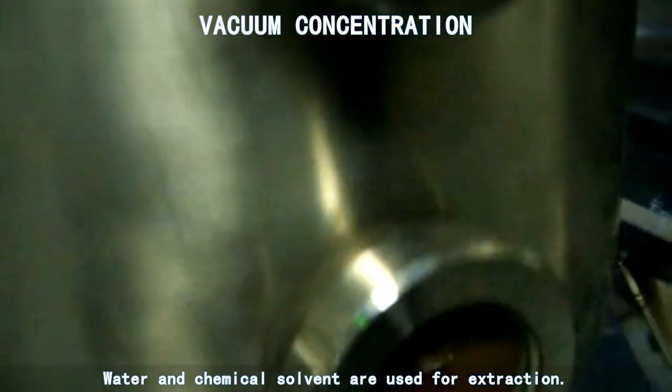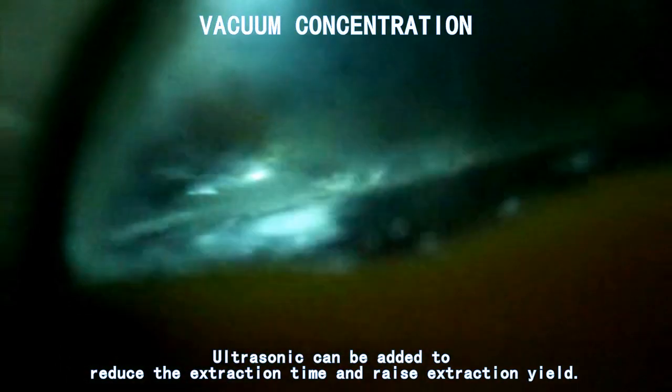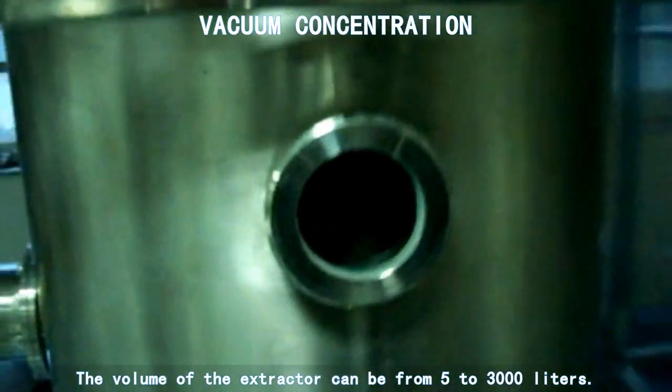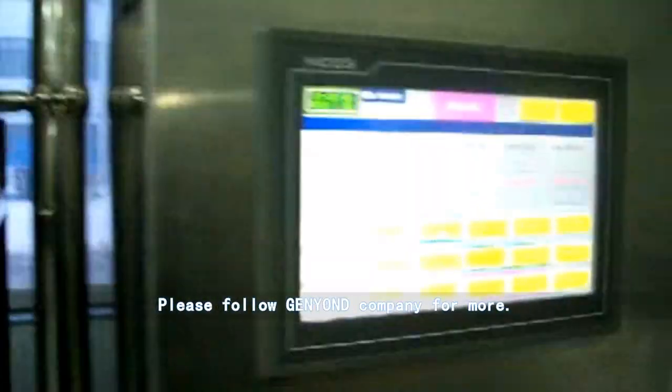Water and chemical solvent are used for extraction. Ultrasonic can be added to reduce the extraction time and raise extraction yield. The volume of the extractor can be from 5 to 3,000 liters. Please follow GENYOND company for more.